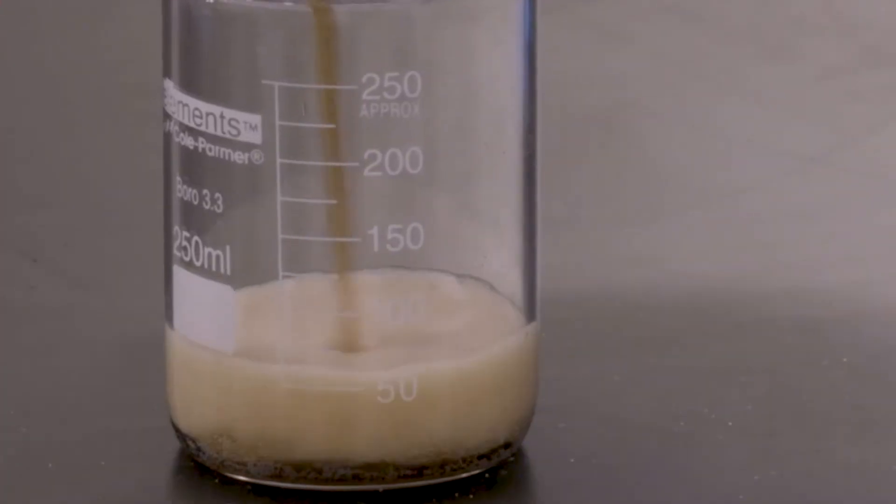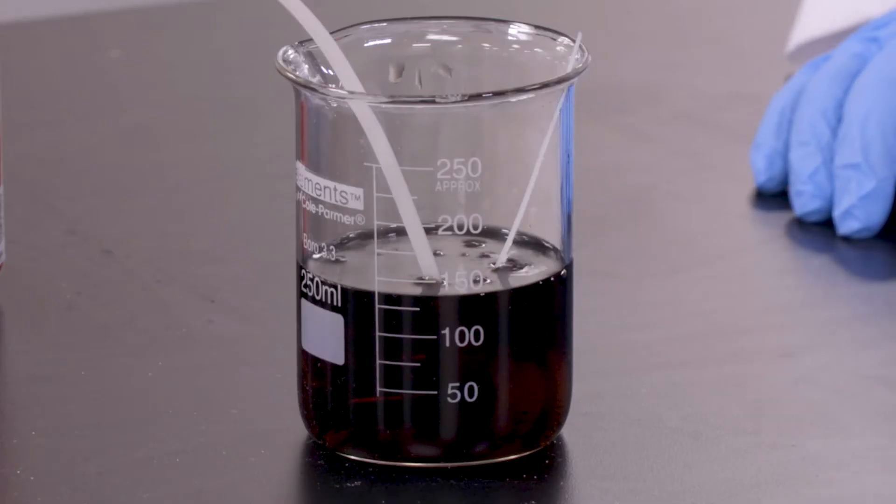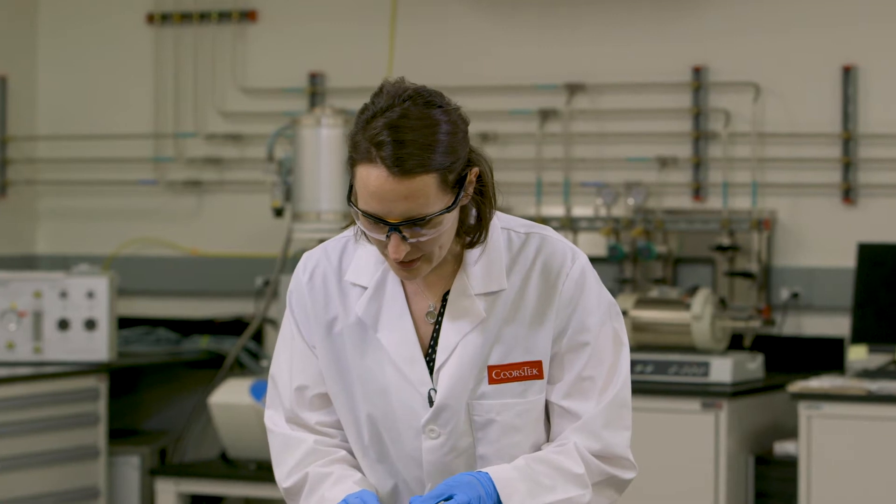We're going to pour the cola into the beaker so we can soak our metal and ceramic. As I'm looking into this right now, I can see some bubbles, so it appears our corrosion test might be working.